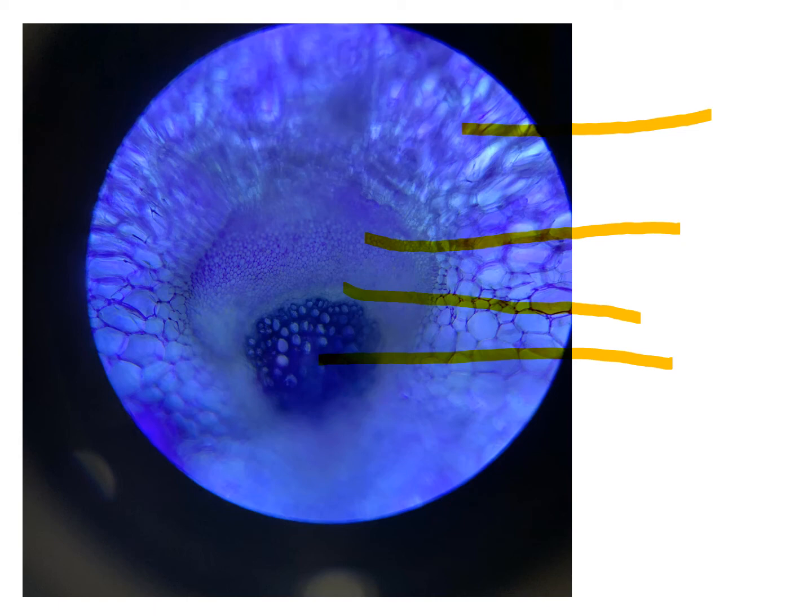What you would do when you were looking at this is just focus up and down a little bit, just so you can get slightly better focus. Now you can see there's more than one layer of cells here. So it is quite a thin section, but it's not a perfectly thin section. So it's not just one cell thick, which is why it's a little bit more difficult.